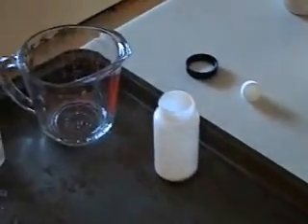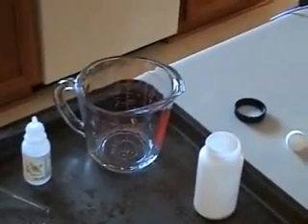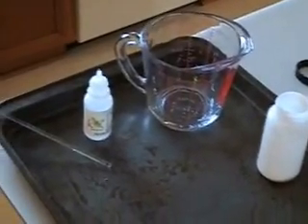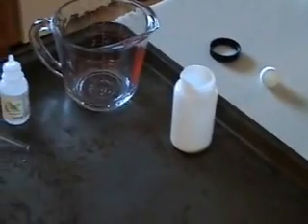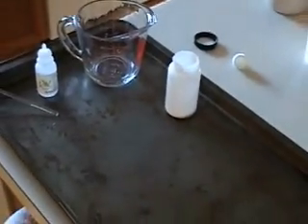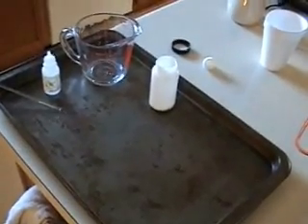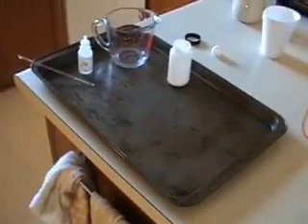Make sure that you have something that you can heat up water with. In this situation, I have a Pyrex measuring cup. And you have your sodium hydroxide with a stirring rod, which is attached. Now again, what I have done is I've put it in a pan so that I will have a safe working area. The other things you're going to need to make sure you have are your apron, goggles, as well as protective gloves.